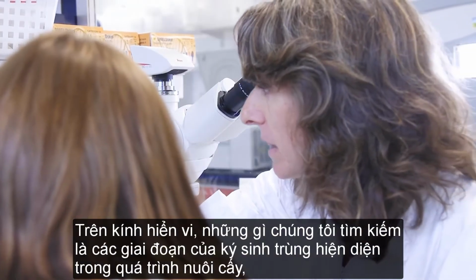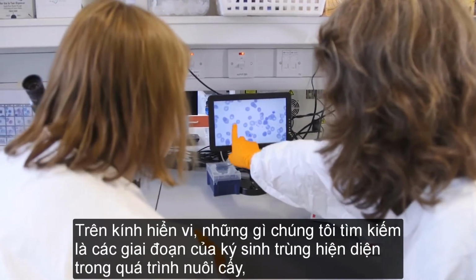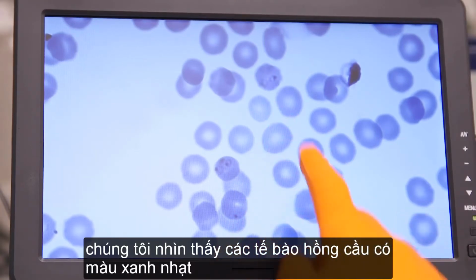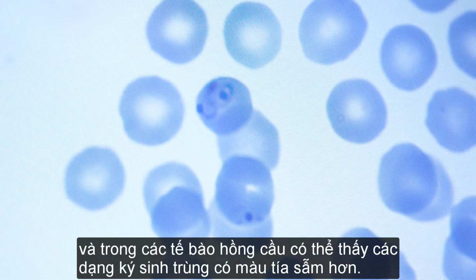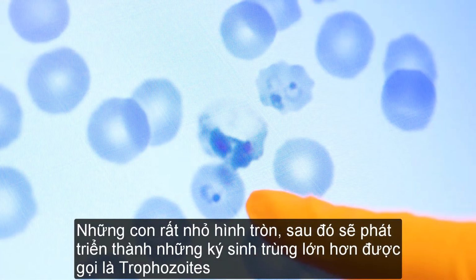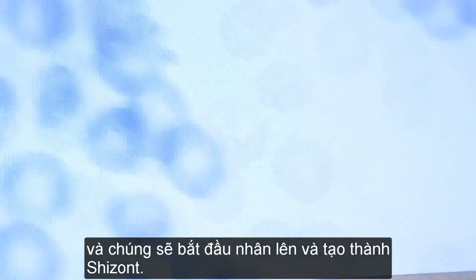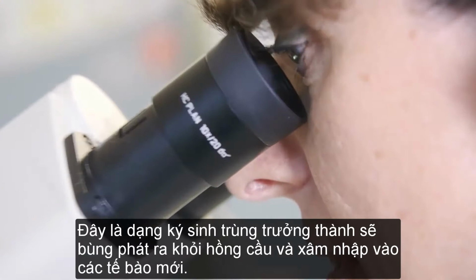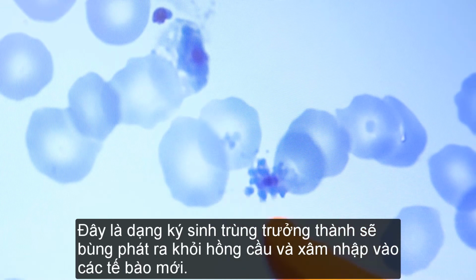On the microscope, what we look for is the stages of the parasite that are present in the culture. So we see the red blood cells in light blue, and within the red blood cells we can see darker purplish forms of the parasite. The very small ones are rings that will then grow into bigger parasites called trophozoites, and these will start multiplying and forming a schizont. This is the mature form of the parasite that will burst out of the red blood cell and invade new cells.